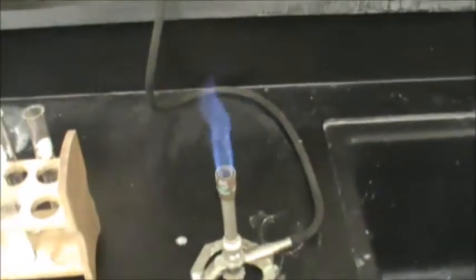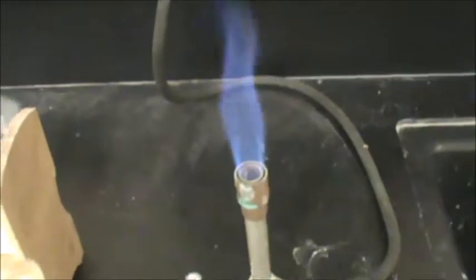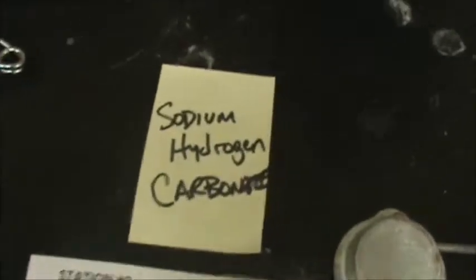I got a Bunsen burner already going. Got some nice combustion going on right there. But anyway, I started it up and we have a chemical called sodium hydrogen carbonate. It looks something like this. Take a look. Sodium hydrogen carbonate. It's a white crystalline solid. It's just sitting inside this test tube, sometimes called baking soda. You can buy it at the grocery store. It makes cookies. Delicious. Well, actually, it doesn't make them delicious. It makes them, well, puffier.